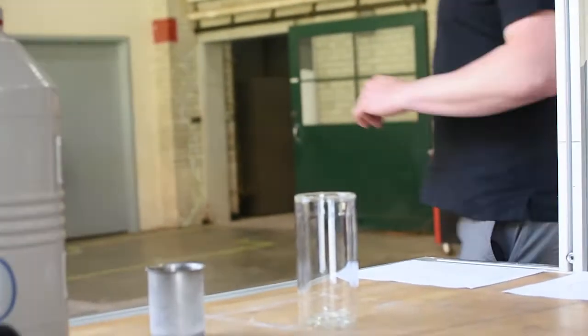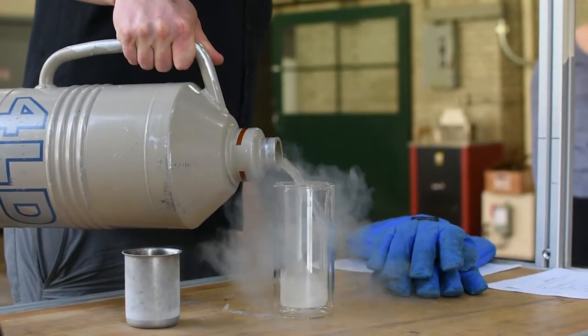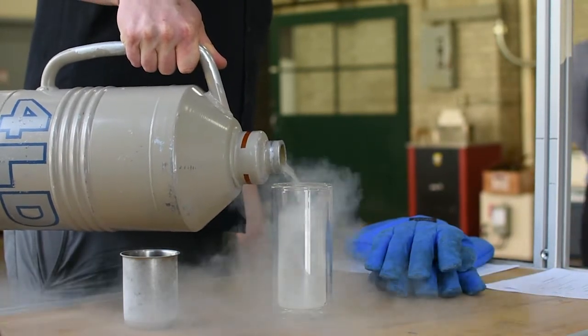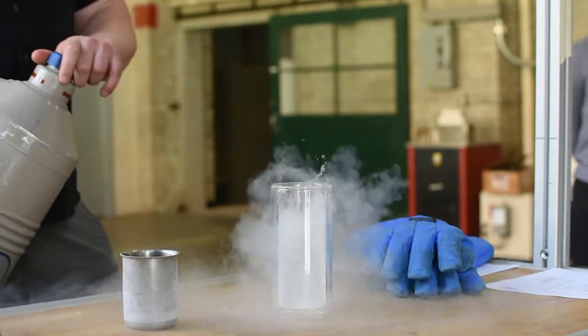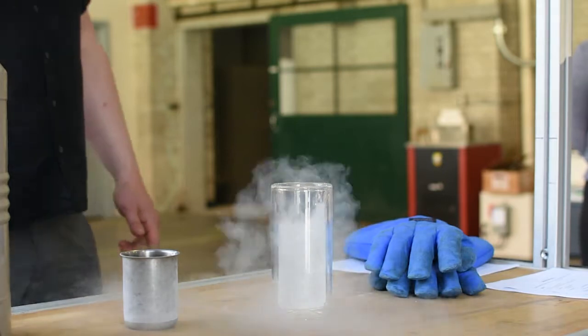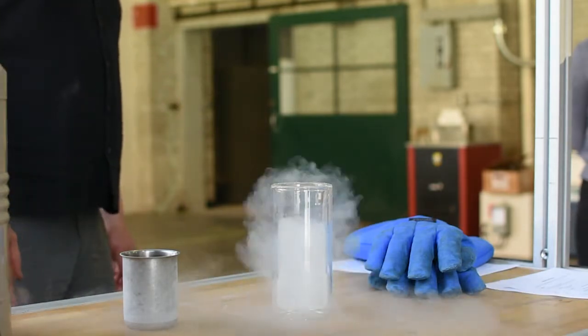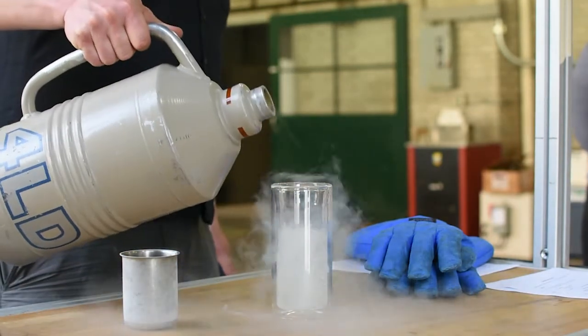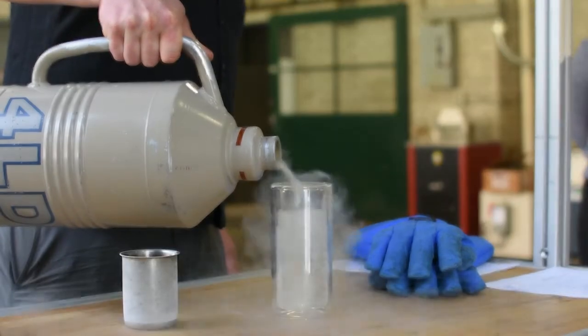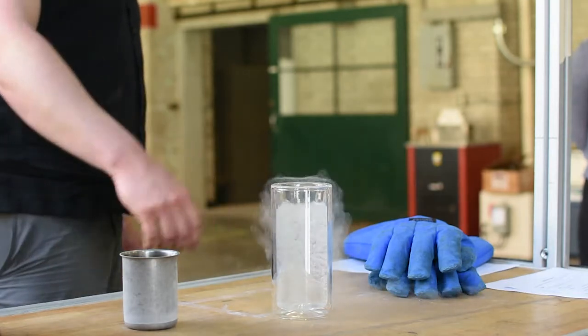And so a demo I'm going to do here for you is to show you how powerful liquid nitrogen is trying to get away from you, and that the key is just not trapping it against you. I'm filling this Pyrex vacuum flask here with liquid nitrogen. We'll just let it cool off. It'll settle down as soon as it chills down that innermost layer of the Pyrex. See, now the bubbling's starting to flow down.